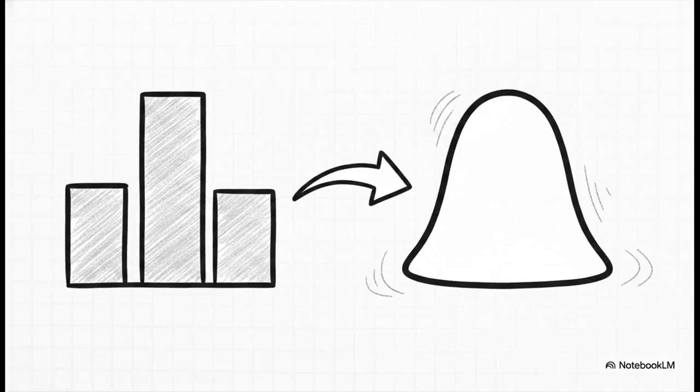And this brilliantly illustrates the real magic of the model. If you look closely at those initial simulated peaks, they're a bit non-symmetrical and chunky, right? But as you crank up the number of equilibria to a very large number and factor in natural diffusion, those non-symmetrical steps smooth out perfectly. They eventually create the smooth, beautiful, symmetrical Gaussian distribution curves that chemists see in real-world chromatograms every single day.